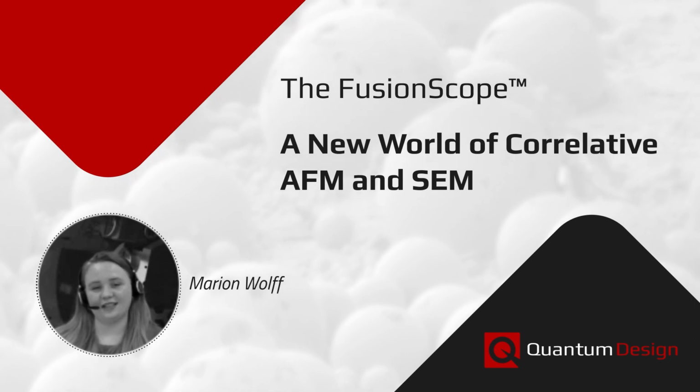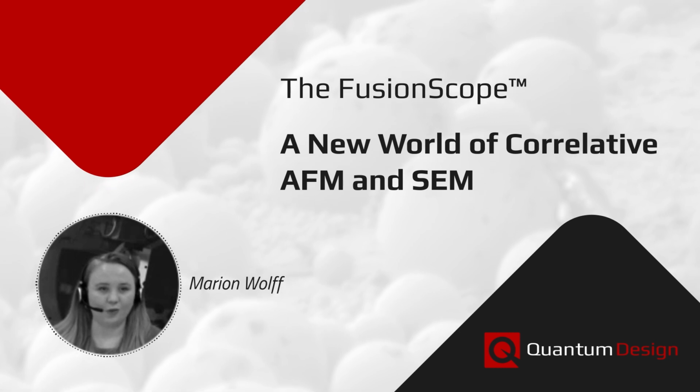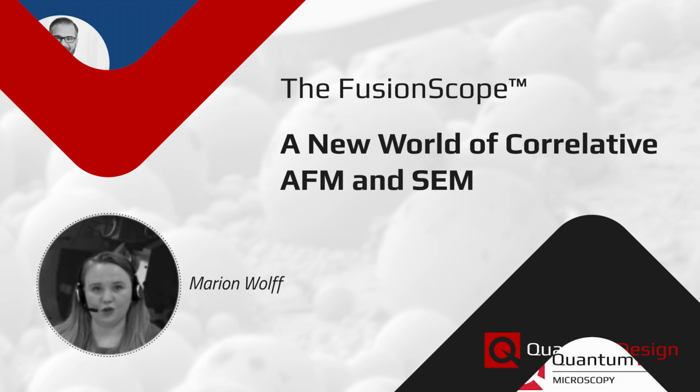Today, me and my colleagues are going to tell you more about the newest tool by Quantum Design, the FusionScope, a correlative AFM and SEM in one tool.